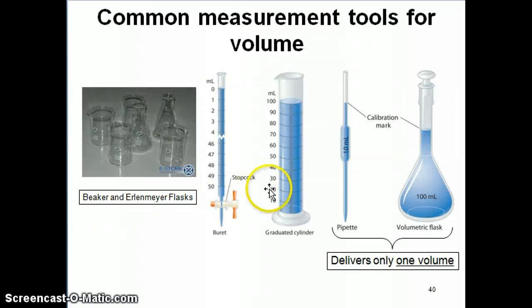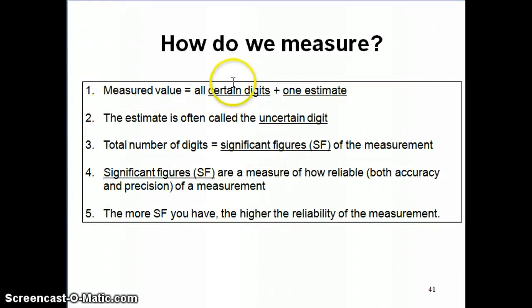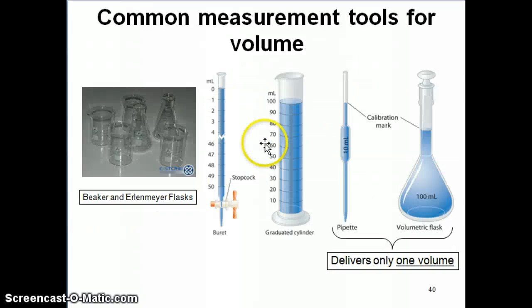Let me refer you to this measurement, this graduate cylinder now, and then we'll talk about a specific measurement in a second. If you look at these numbers here, it says 60, 70, 80, and so on. And you can see these little marks here, which probably corresponds to one milliliter. There's probably 10 marks here between 70 to 80, so it'll be 71, 72, 73, and so on. So, those marks correspond to what we refer to as certain digits. That's basically numbers that you can read off from the instrument itself.